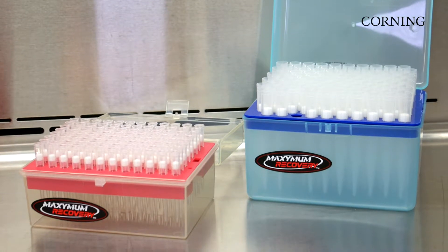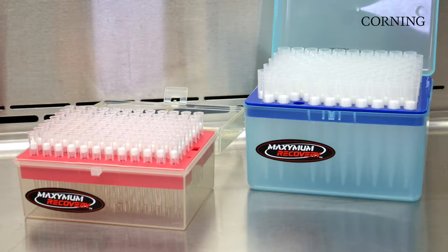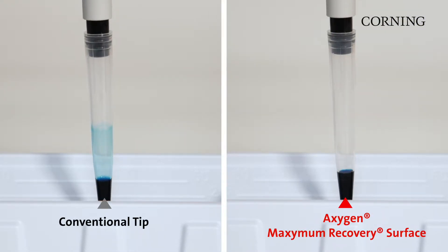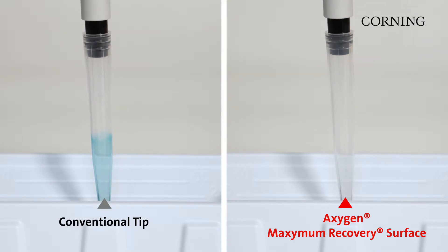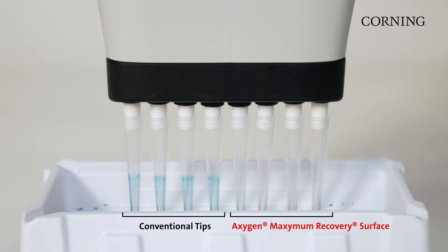Axygen Maxymum Recovery Pipette Tips have been specifically designed for applications requiring high accuracy and reproducibility. Our unique technology gives Axygen Maxymum Recovery products an ultra-smooth surface that reduces liquid binding and can result in more precise pipetting.